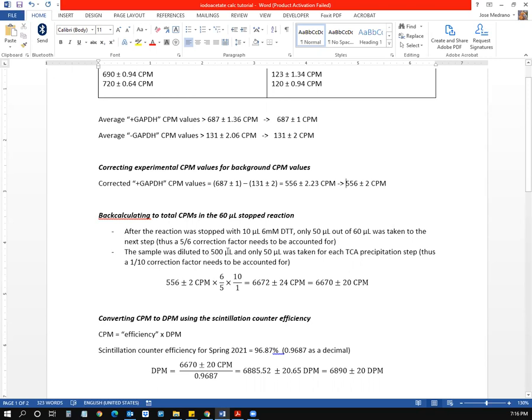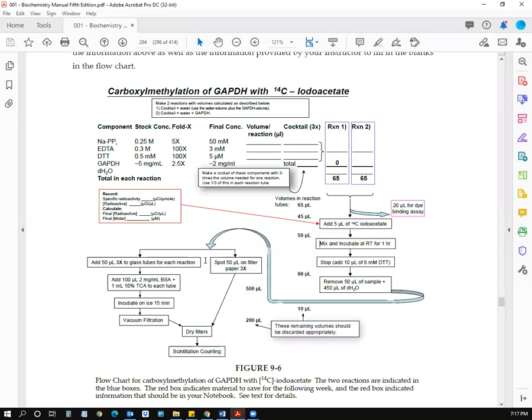But the part that we need to take into account is only when we are then measuring for filtration a small portion of the dilution. So for example, each of these filtrations, we're not losing any material. Yes, we are diluting it with more BSA and some TCA, but basically that entire TCA precipitation was then applied to the filter apparatus completely.